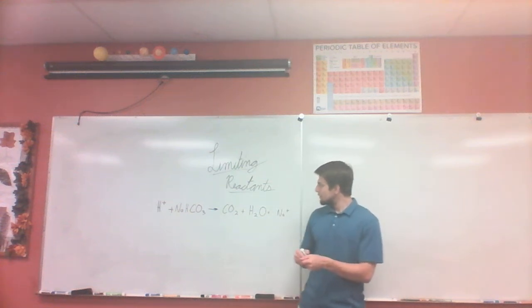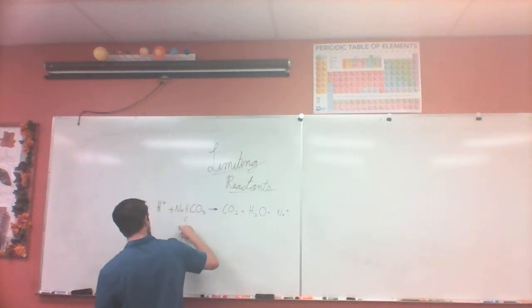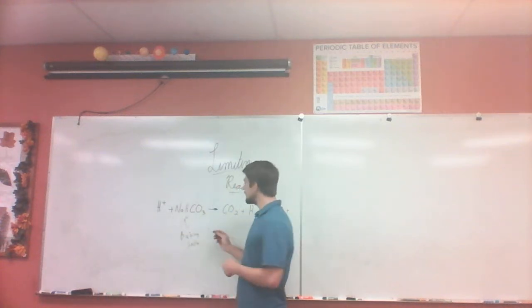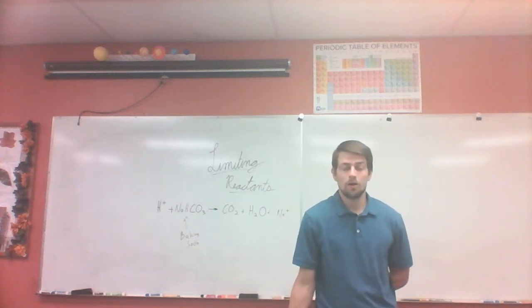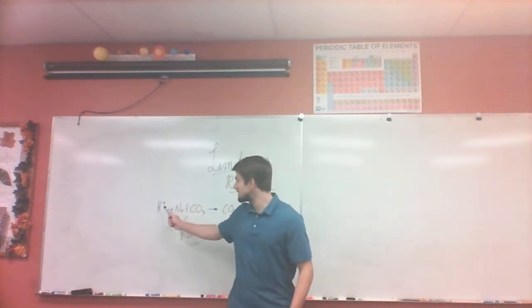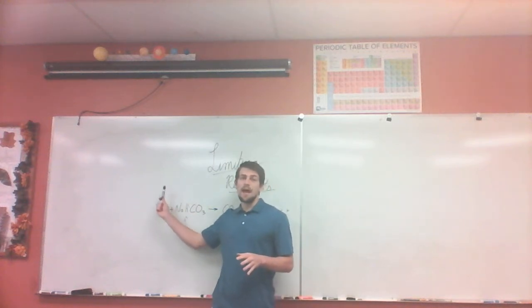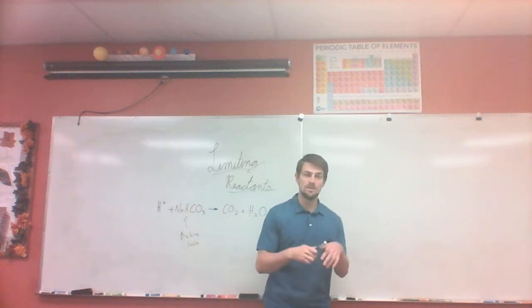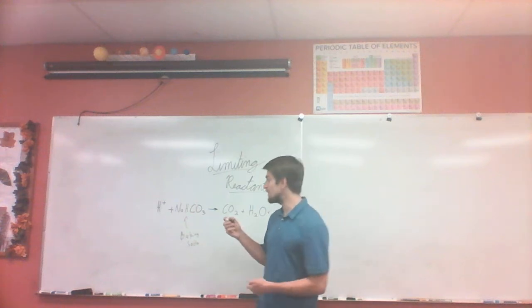But I have this fancy compound, NaHCO3, which is also called sodium bicarbonate, and that is just baking soda. And I have it being added to an H+. If you remember, acids are chemicals that like to give away hydrogens in chemical reactions, and it often comes in the form of an H+. It has a positive charge. So this H+ really represents the acid in vinegar. Vinegar is just acetic acid, and so I simplified the equation a little bit and just wrote the H+ that we're going to be getting from the vinegar.